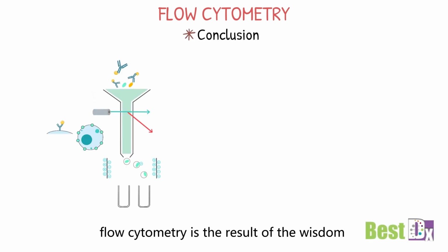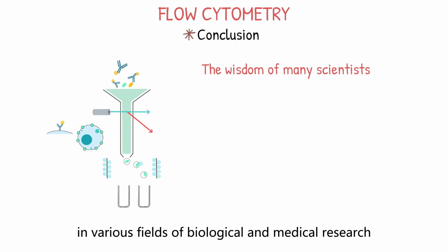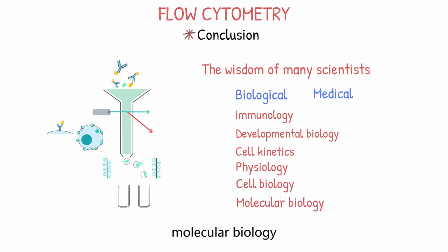In conclusion, flow cytometry is the result of the wisdom of many scientists, and the power of flow cytometry has made it widely used in various fields of biological and medical research, such as immunology, developmental biology, cell kinetics, physiology, cell biology, molecular biology, etc., with significant applications.